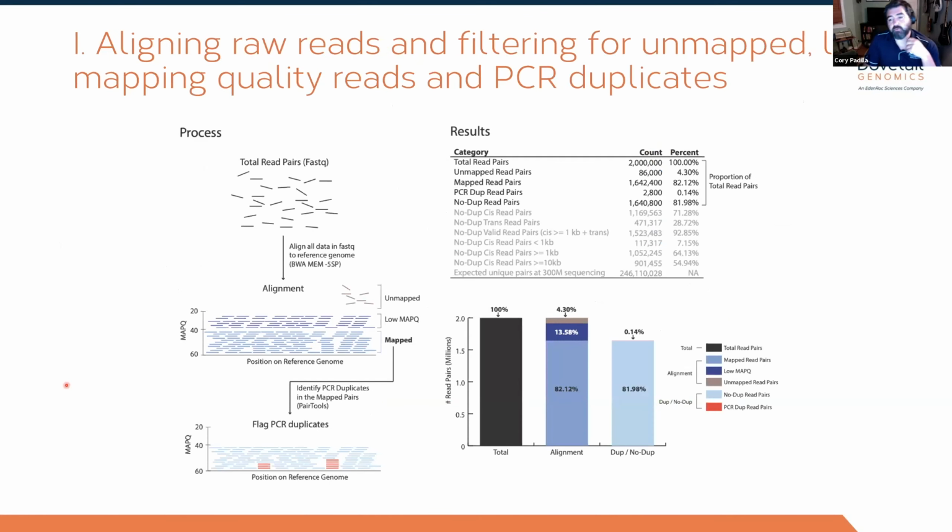All right, so how do we go about doing this? Well, it starts with the alignment, as with any NGS data type. Here we take the raw FASTQs and we align with BWA with the -5SP option. What this essentially means is it turns a paired-end aligner into a single-end alignment, but it does this by using the pairs. So I'll walk you through it.